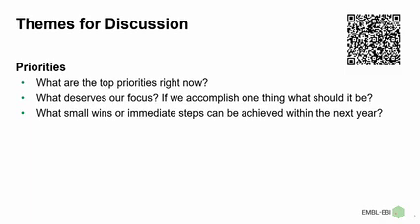First of all, thank you very much for the great talks. I would have two questions indeed. When we think about data repositories and about data quality, we oftentimes think about MS1 stability, MS2 fragmentation patterns. We think about annotation levels.